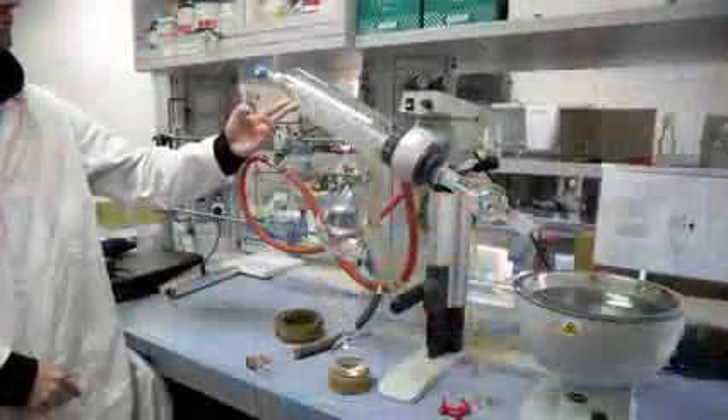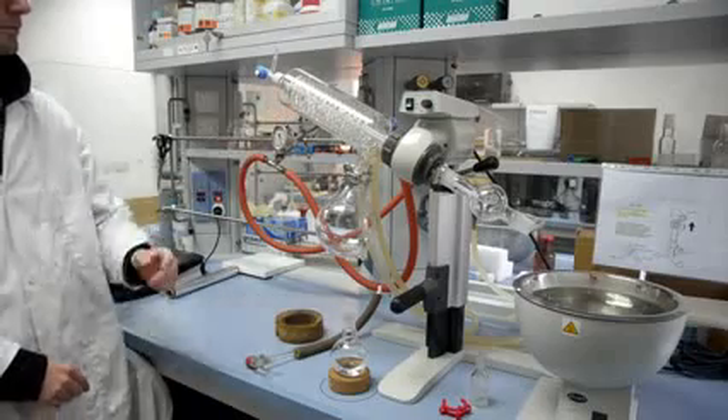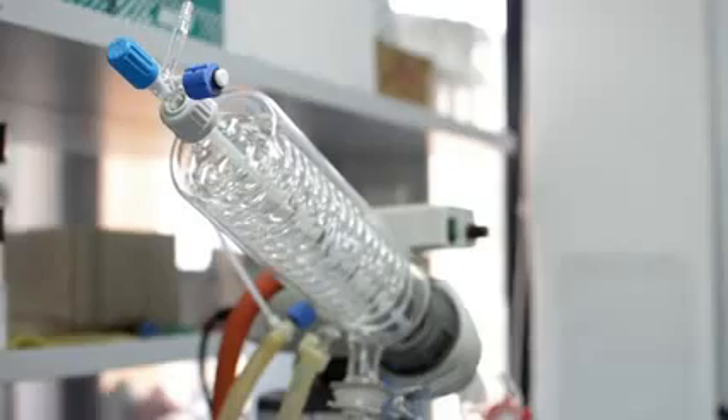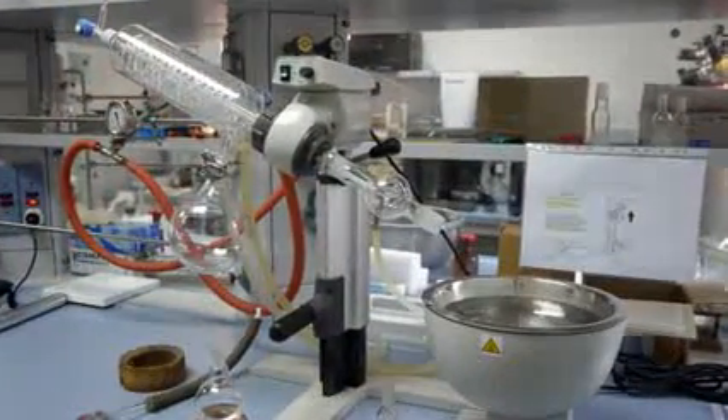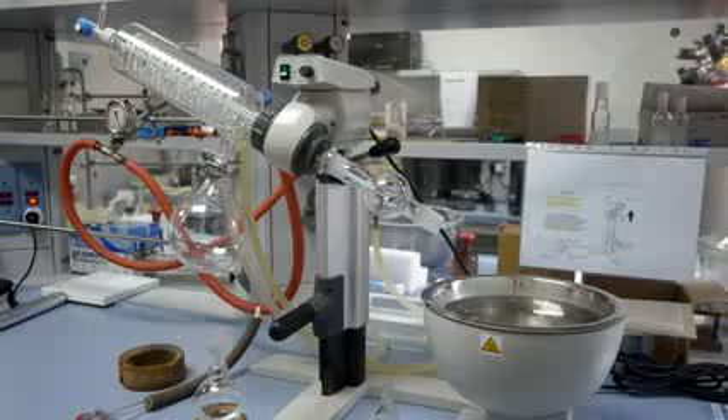The Condenser is where solvent condenses as it comes into contact with a regular flow of water, which acts as a coolant. The Waste Jar is where the evaporated solvents are captured and retained.